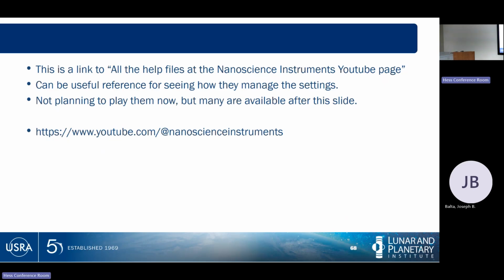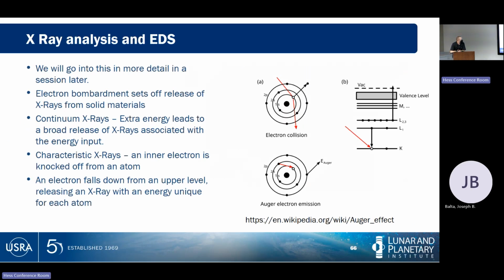He explained earlier that working distance is basically the distance between the final focal point of the beam and the sample. He explained why you might want to have a short working distance for a flat sample and then a large working distance for a 3D sample to give you more depth of field.